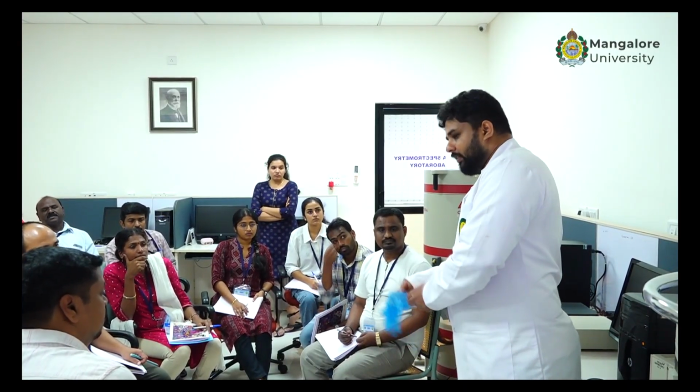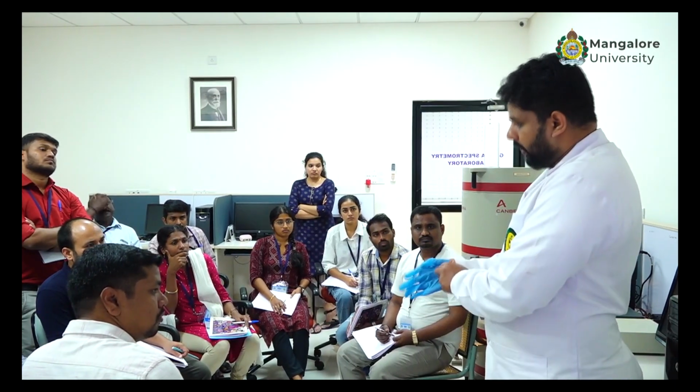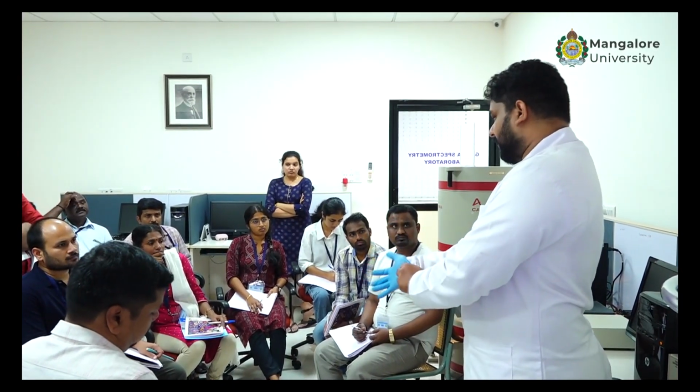Initially we will see how the spectrum for cobalt and cesium looks in a sodium iodide detector. This exercise might take 2 days. Today you can take the efficiency values and plot the efficiency graph. Tomorrow you can take the activity and calculate the activity of the sample.